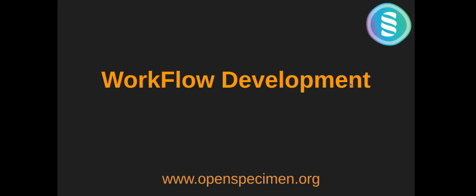from scratch. So this video will be divided into two parts. The first part will be focused on the different components of the workflow, and in the second part we will demonstrate how to create your workflow from scratch. So let's start.